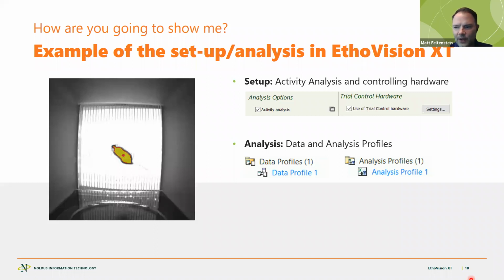So just to give you a couple of caveats before we get started. I am going to be using EthoVision XT version 16. I believe this came out a week ago today. This is a very, very new version. So you may see things, if you're using an older version, which most likely you are, very few people have 16 already, that look a little bit different.